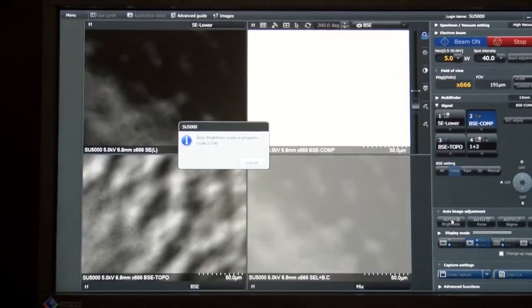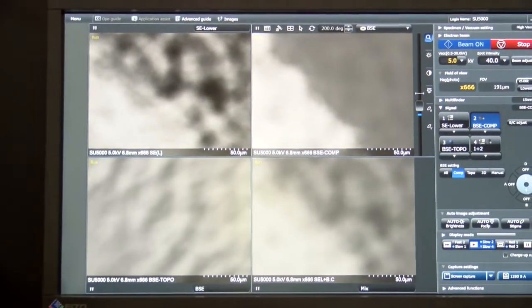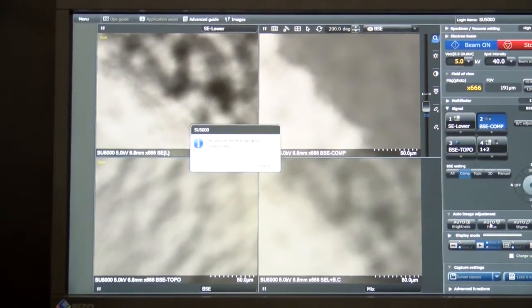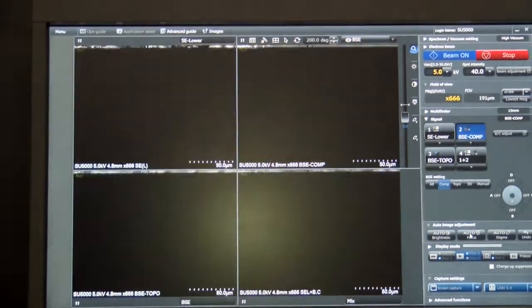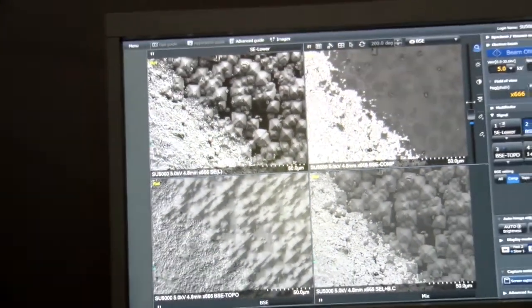You'll see here how quickly the auto brightness will adjust. It's going to go through and make an adjustment for each of the detectors, adjusting the brightness. And now with a click of the button, it does the auto focus. For SEM users out there, you'll notice that is very fast — a lot of surface information there on that image, just at a click of the button.